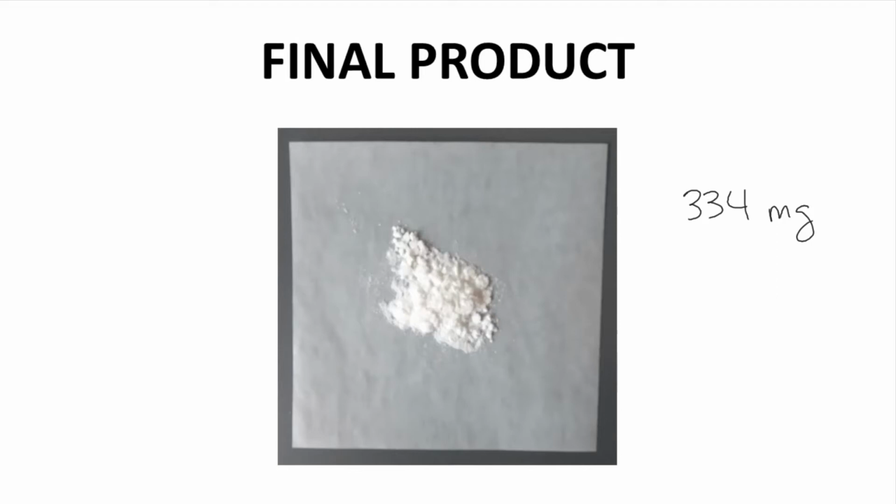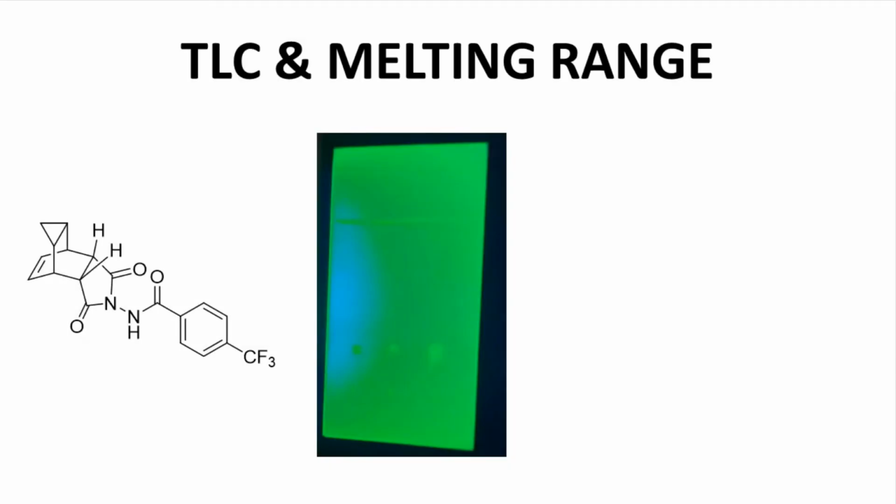Of course, the appearance of a product is not the same as gathering characterization data as evidence of purity and structure. We need to look at some data before being too confident on the success of this reaction. Let's begin with the TLC and melting point data. On the screen, we have the TLC of our product.